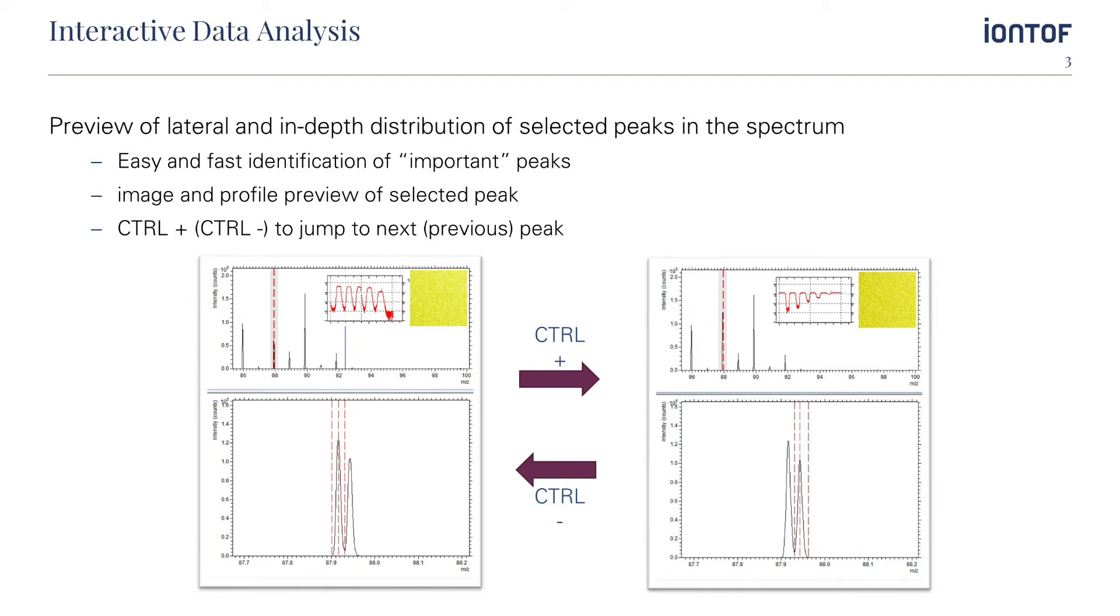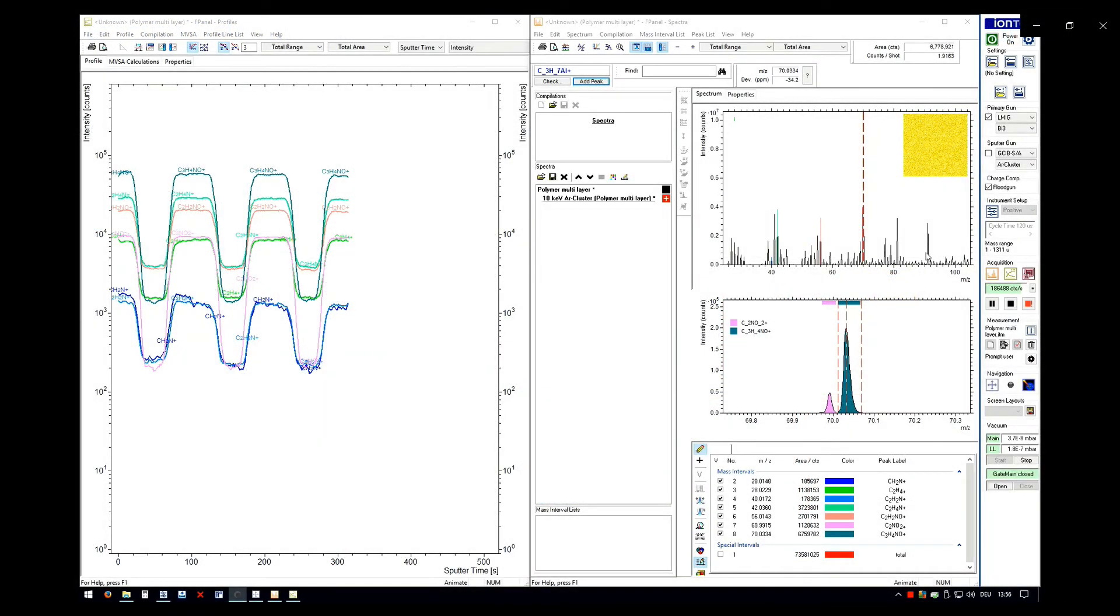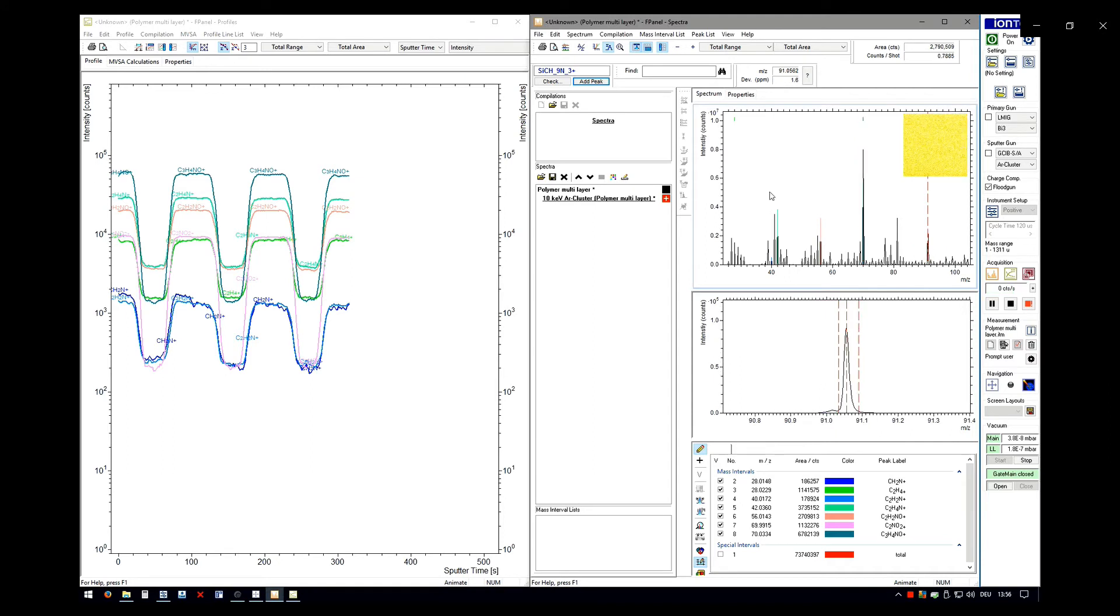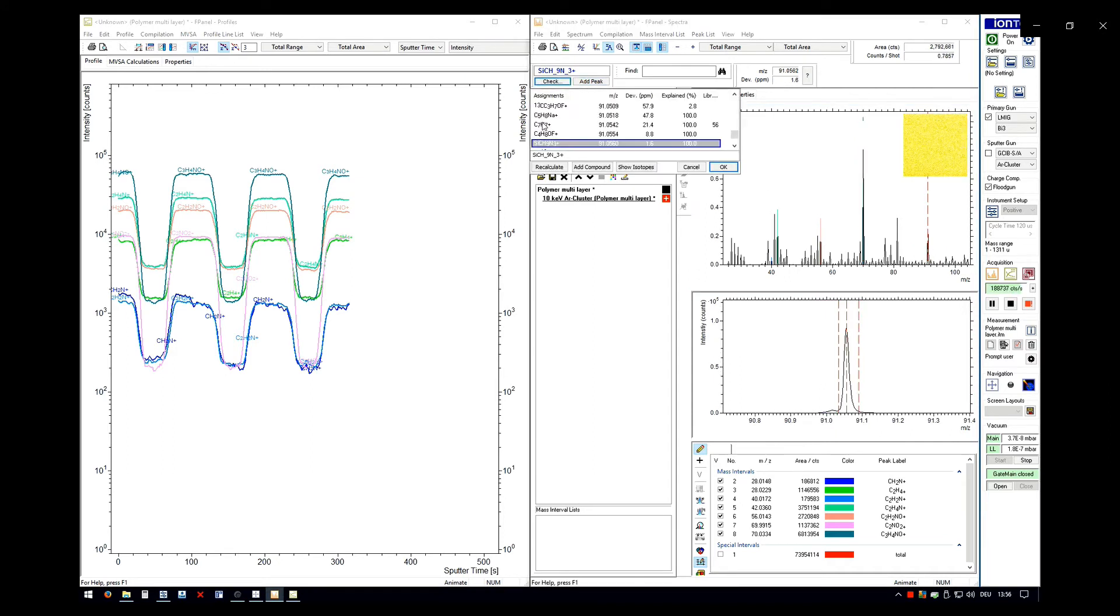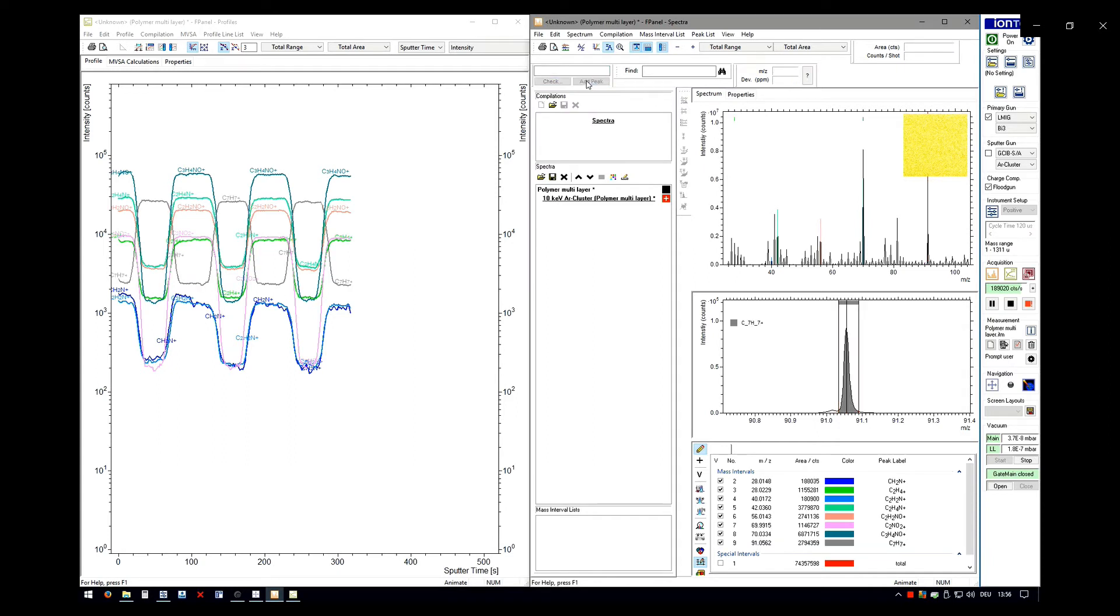Let's have a look at the live data acquisition to get the best impression of the powerful interactive data analysis. This is a depth profiling acquisition and you can see, as soon as you select a mass interval and add it to the peak list, the profile line will appear from the very beginning of the acquisition.